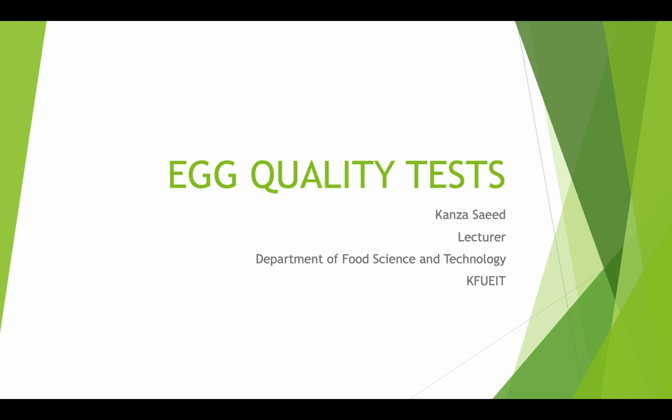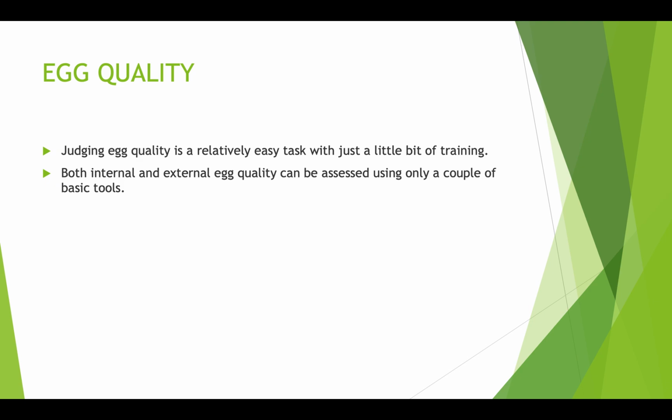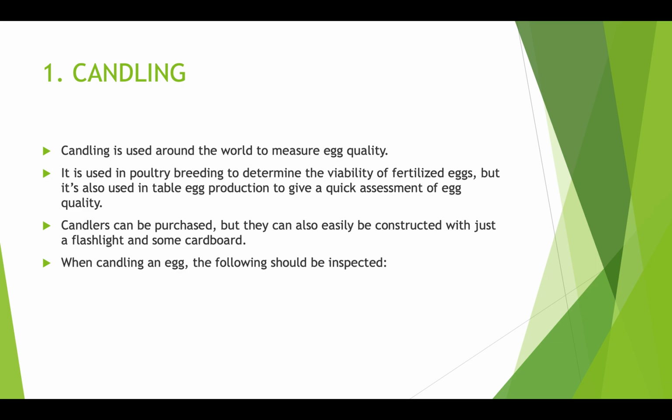In this lecture, we will discuss egg quality tests. Judging egg quality is a relatively easy task with just a little bit of training. Both internal and external egg quality can be assessed using only a couple of basic tools. The first test is candling.